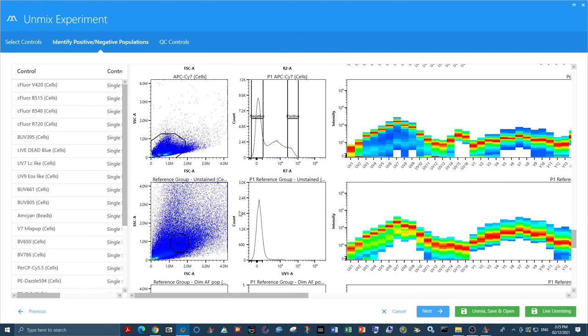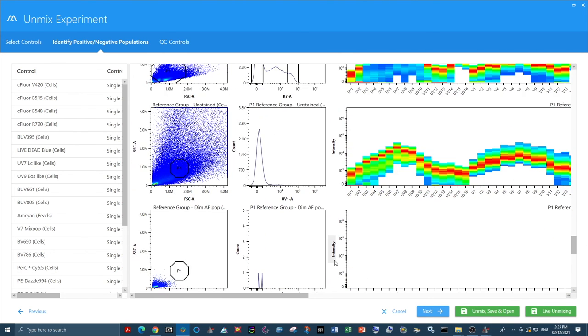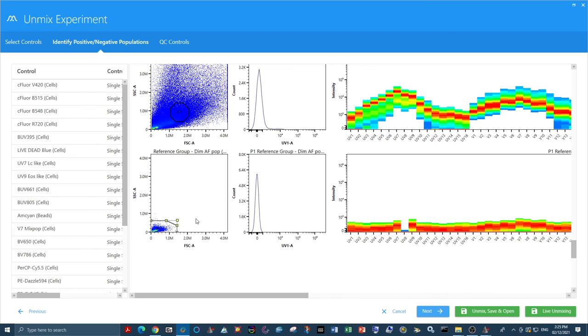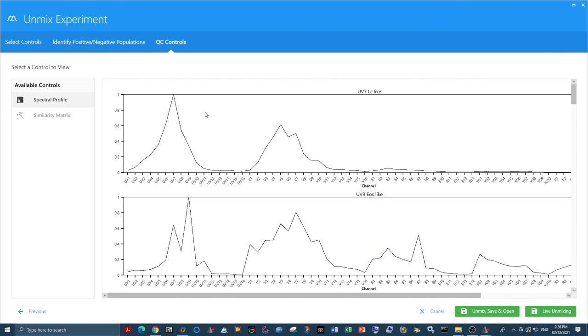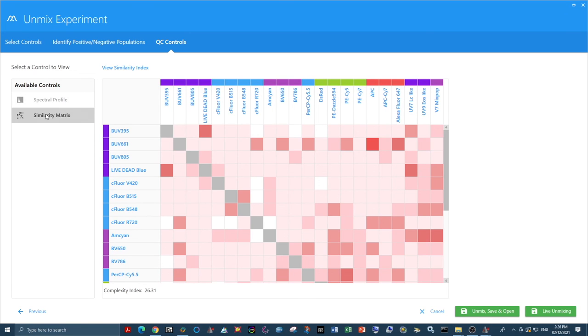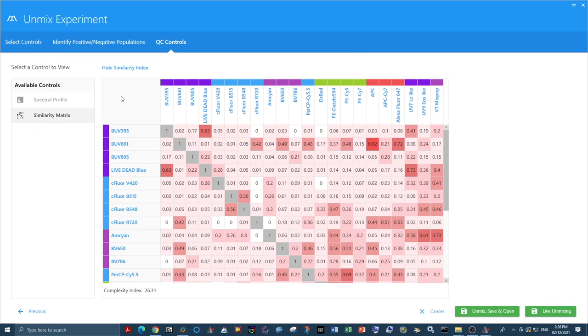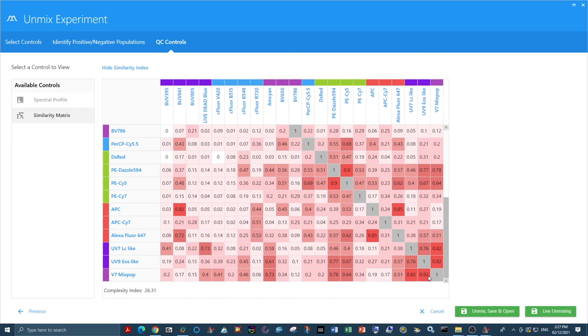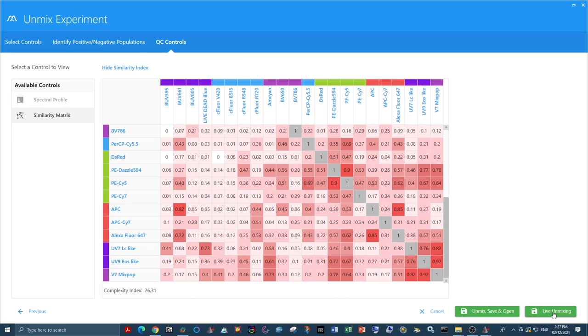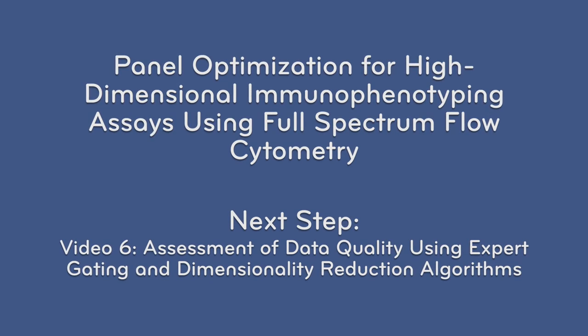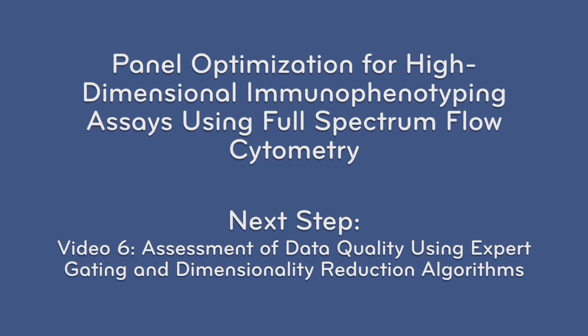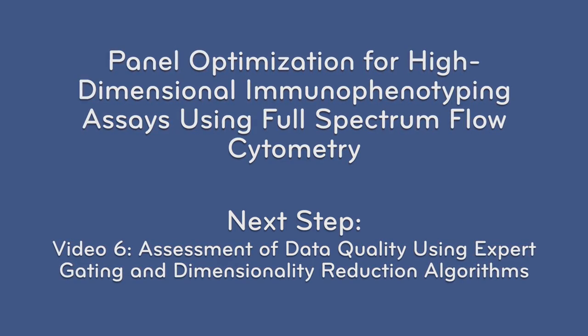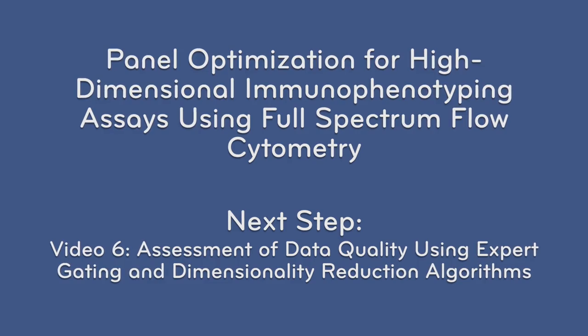Once all of our gates are correct, we can then go through and QC our controls to check the similarity of our different autofluorescent populations. Coming to the similarity matrix, we can view our similarity index and see how similar our different autofluorescent signatures are. You can see that they are all similar with the highest similarity being 0.92, but that is still underneath the 0.98 threshold. So they are indeed individual spectral signatures. Then we go ahead and we live unmix.